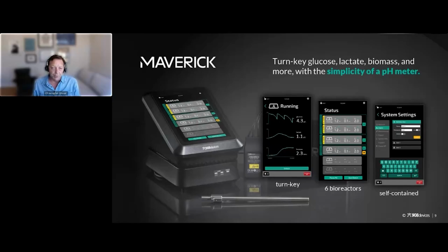So Raman systems that have been available and generating some excitement in the marketplace due to the technology capability have really been quite challenging to actually get up and running and configured.